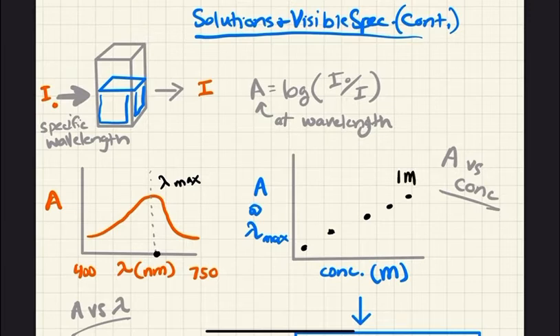And then we had 0.0001 as our lowest concentration. So just to kind of frame us back to that. Now, you'll notice that they have a linear trend, and that should be observed in your data in the lab as well, because there is a stoichiometric relationship, and you can get a best fit line, which, sorry, my line is not the straightest here, but you can get the equation for that line in the format of y equals mx plus b.